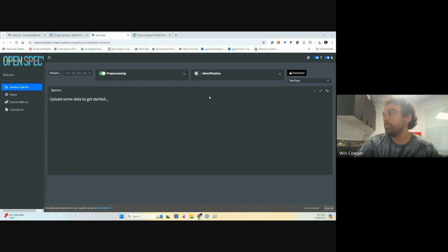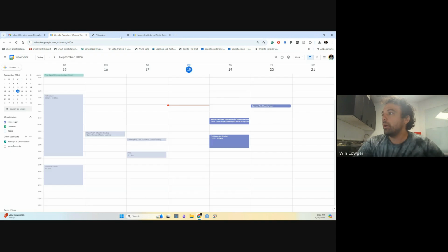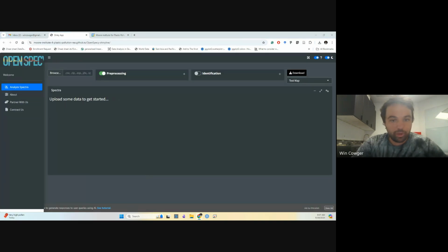All right. Okay, so we'll see if I end up running into any issues while doing this tutorial on this new website. I'll switch to the R interface, but hopefully this will work. So let me pull up my notes here.